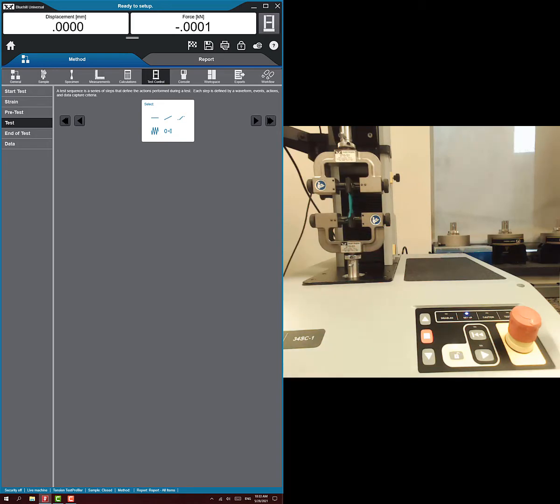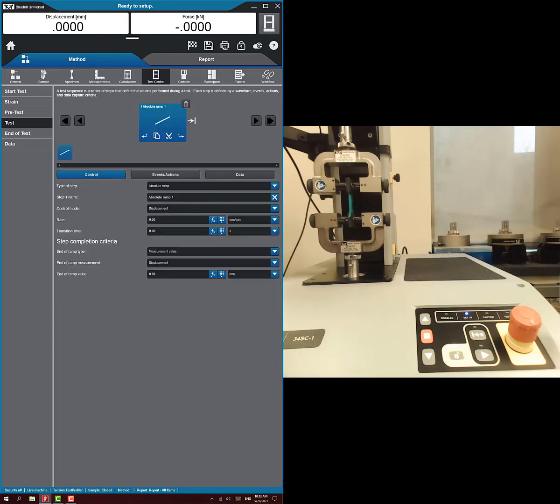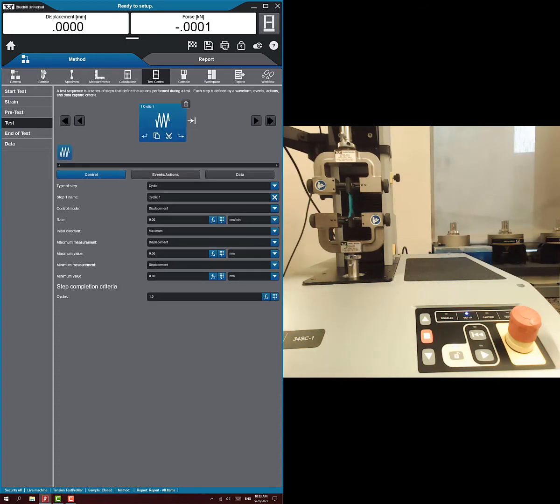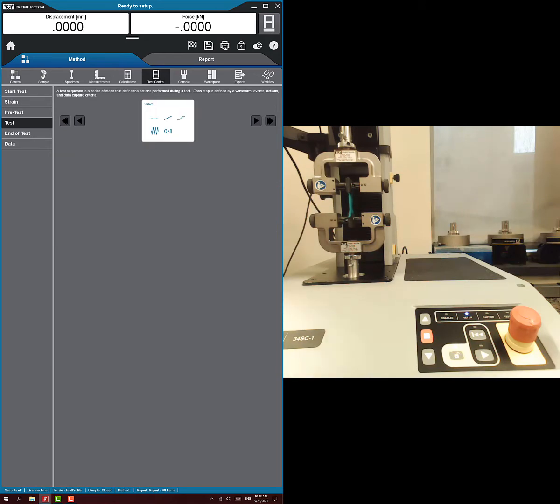We could do a lot of different things with this setup — we could have even done our other tests here. You look at these different forms and choose one. The first is a hold, the second is a ramp, the third is a relative ramp — not just an absolute position from zero to 10 millimeters, but moving another 10 millimeters from where you're starting. Then there's a waveform ramp, and finally an auto balance so you can zero out measurements in the middle of the test.